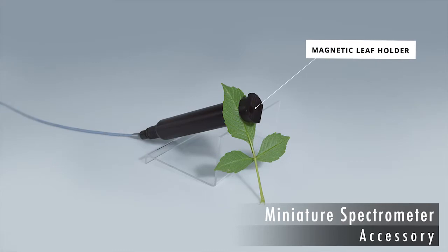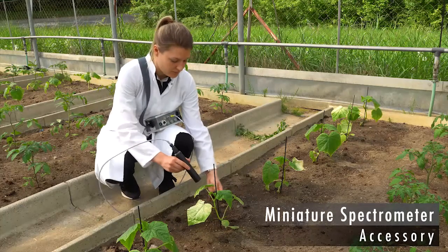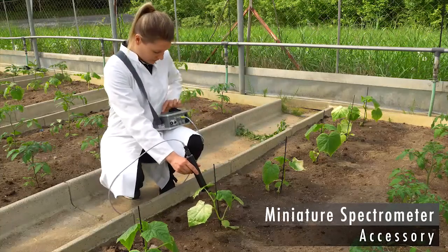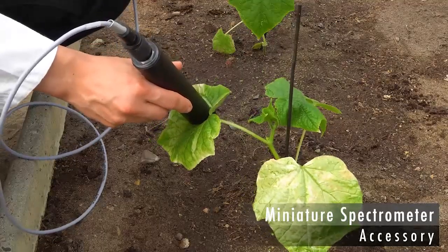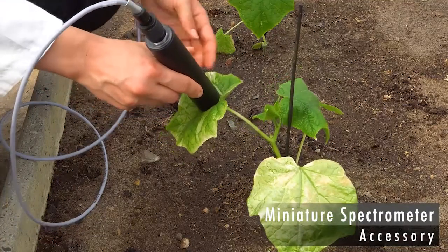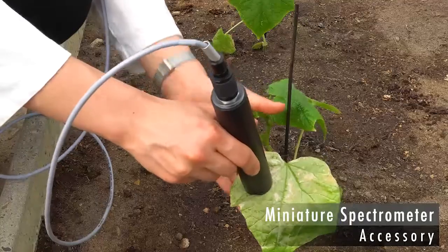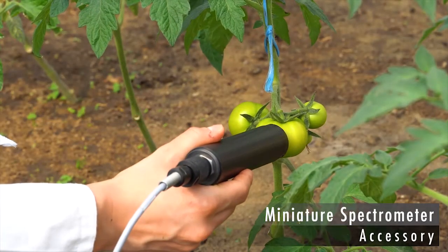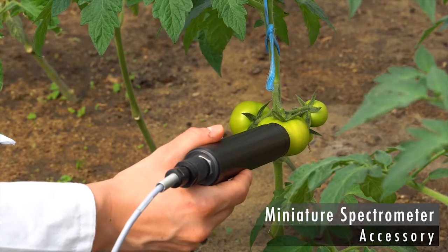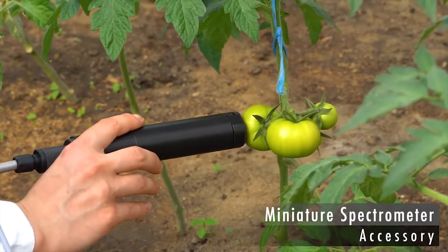A magnetic sample holder positions the sample. An example application of reflectance spectra is a study of the abundance of chlorophylls and carotenoids in senescing leaves. Without the magnetic sample holder, reflectance spectra of fruits can be recorded to monitor the progress of maturation.